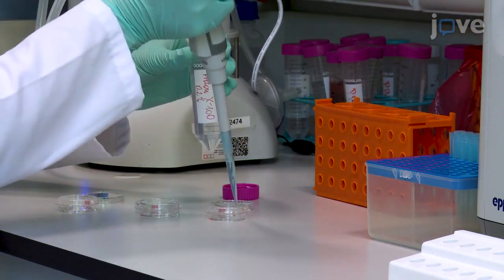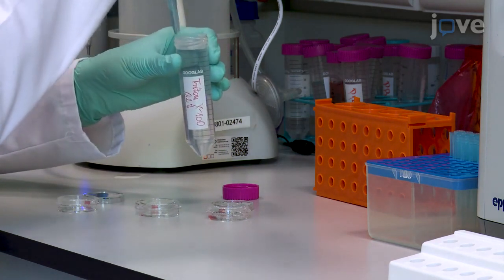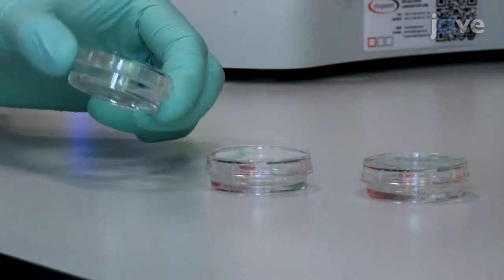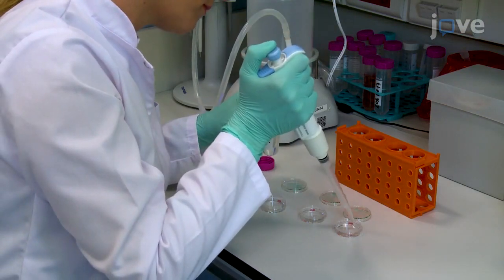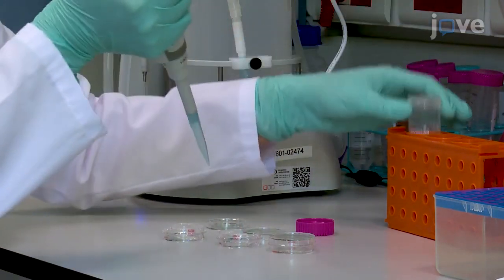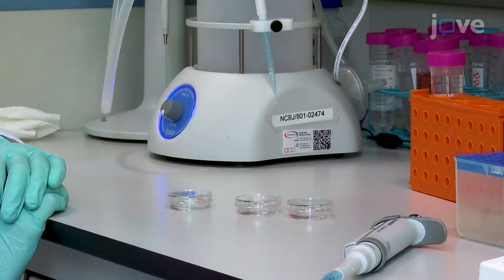Gently add 1 milliliter of 0.2% Triton X100 in PBS to cover the cover slips and incubate the cells for 5 minutes at room temperature. Wash the cells three times with PBS and block the permeabilization with 1 milliliter of 2% BSA diluted in PBS. Then incubate the cells for a minimum of 30 minutes with the 2% BSA.